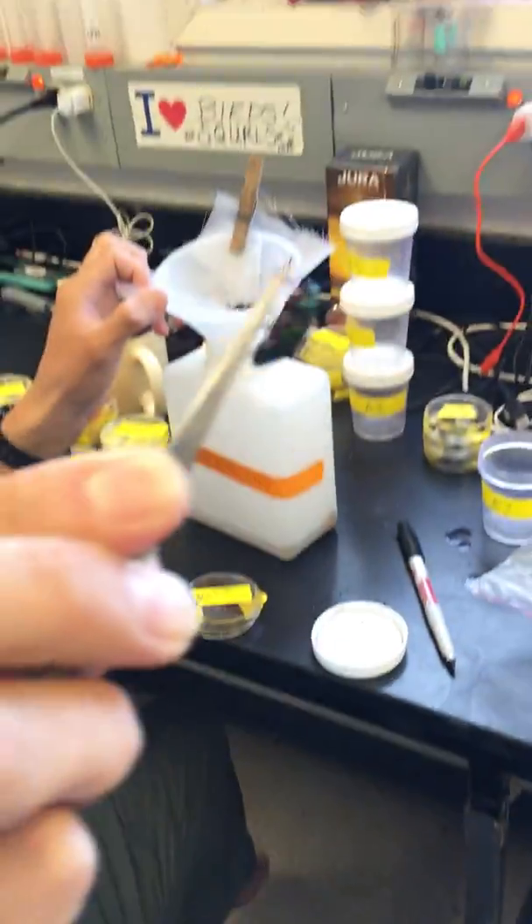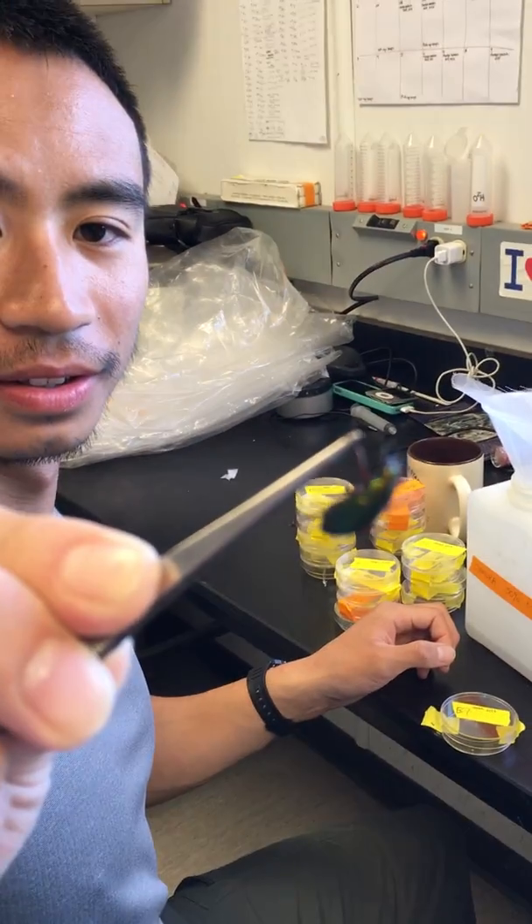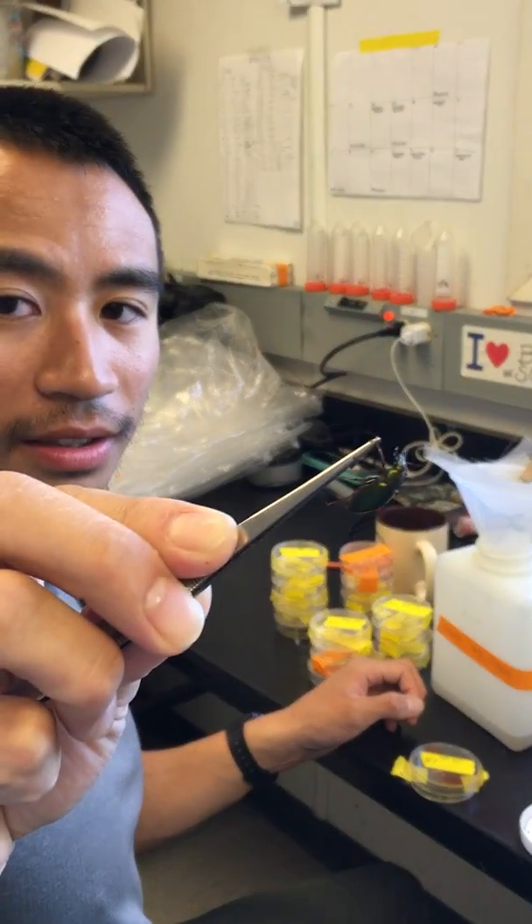Like this one. Okay, wait — sorry, focusing. Cool.